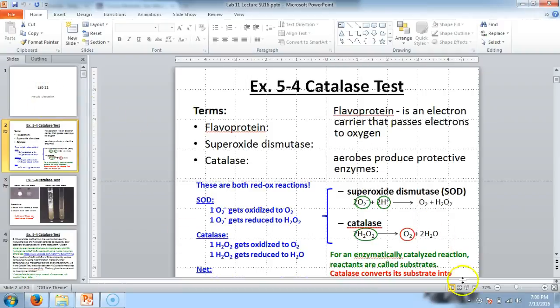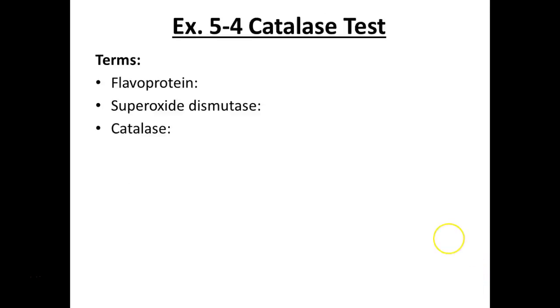So originally we used to do this test in the other lab, but we switched to doing it in this lab because, as you guys already experienced, that lab was a lot, and we still didn't even do some of the stuff we normally did. Remember, we did the inoculations the night before, so we probably still have some moving around to do to try and make it so that some of these labs aren't so packed.